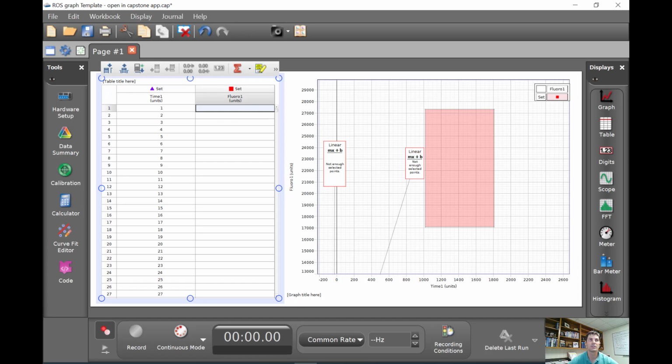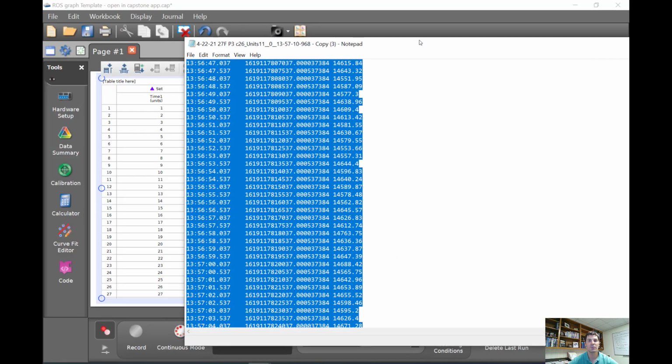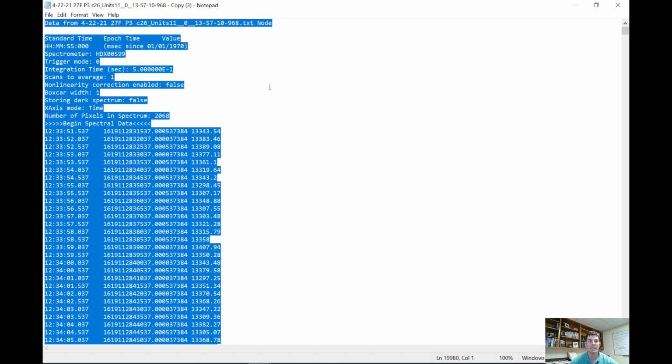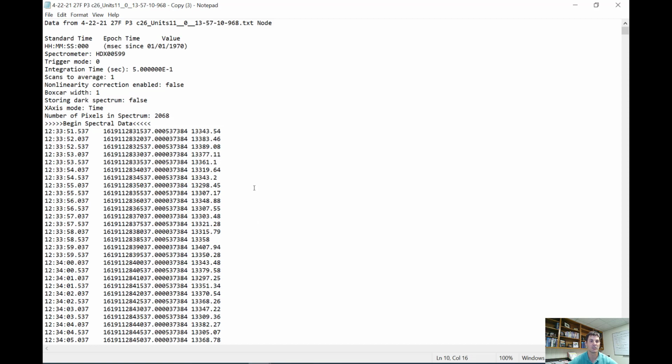So what we want to do is open one of those. So I have one already opened. Again, when you open them, they will typically come in a notepad format and look something similar to this. There may be some slight differences in this, just based on the type of machine that's recording and who's recording it and how they exactly save the data.